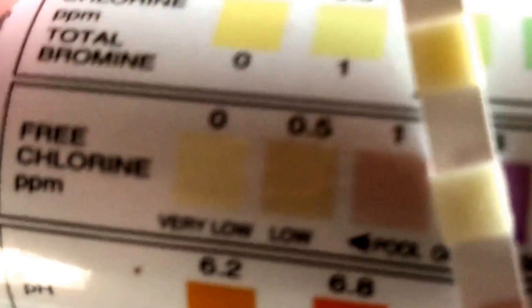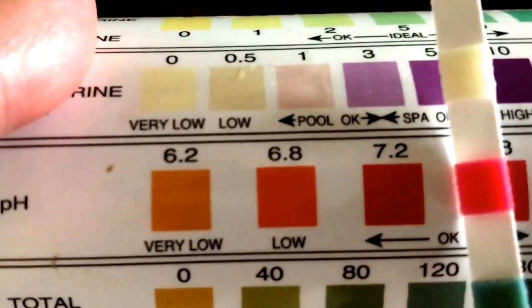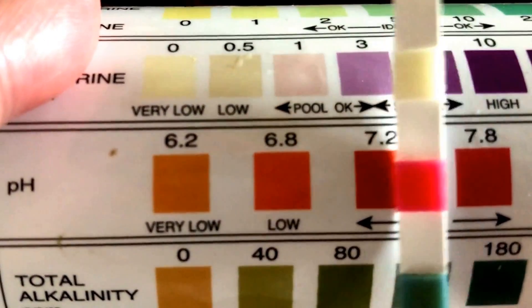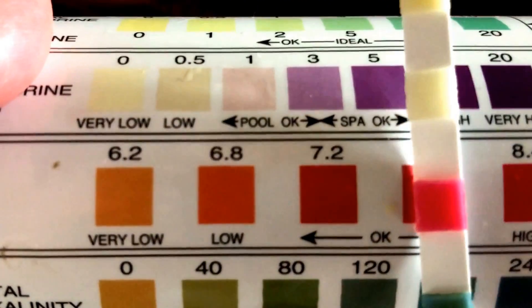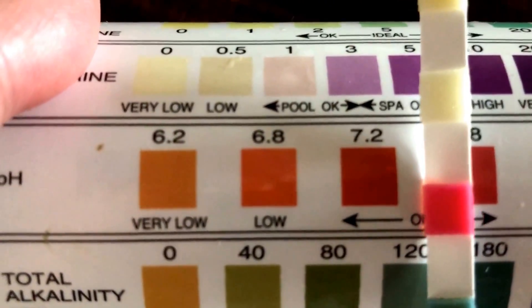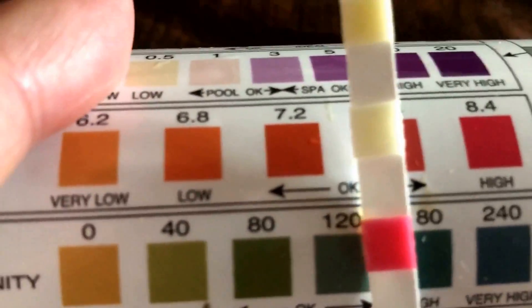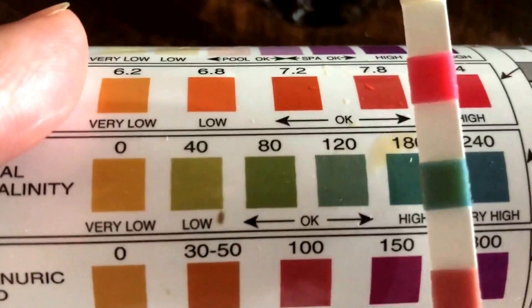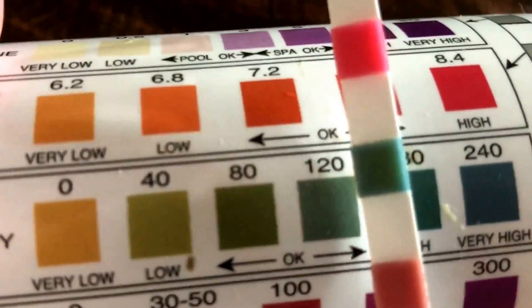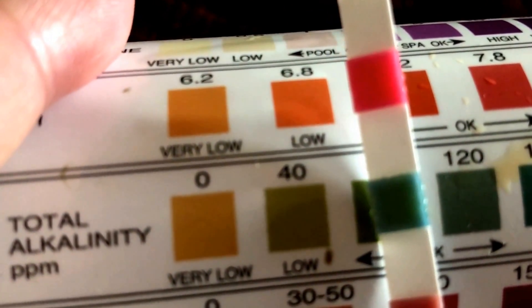Then pH — I am right about here, actually I'm a bit high. So I need to add muriatic acid to balance out the pH. For those of you wondering where you can get muriatic acid, you can actually get it from Home Depot.